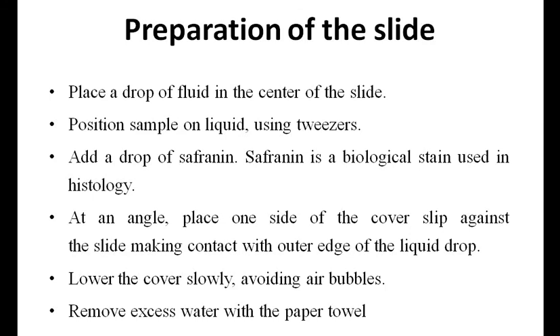Place a drop of fluid in the center of the slide. Position the sample on the liquid using tweezers. Add a drop of safranin. Safranin is a biological stain used in histology.